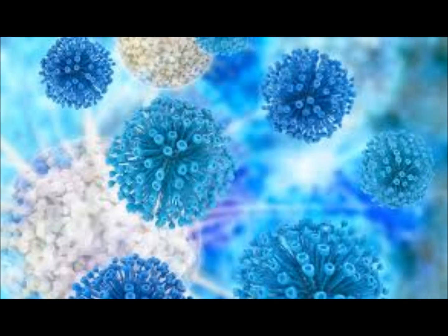Try to only go in here once or twice at the most. And then your streaks don't want to touch. And then that's a new loop, so you can then go to your third quadrant. And technically, you can keep that same loop and go over here, and then your third quadrant. So remember, you should be able to do all three plates with two loops.